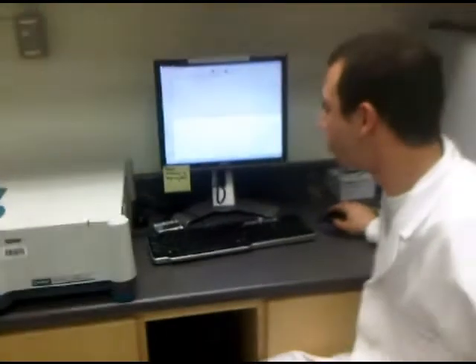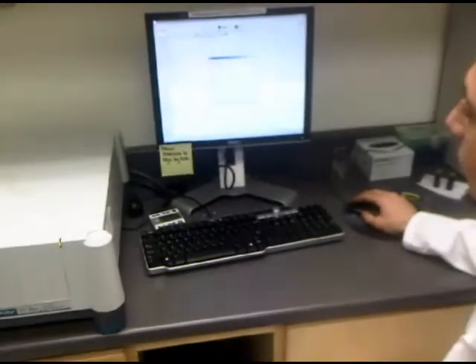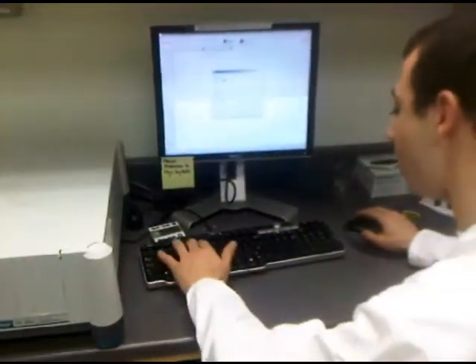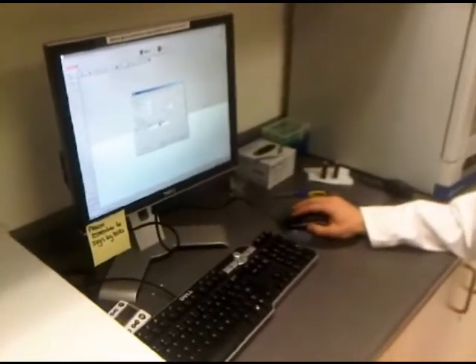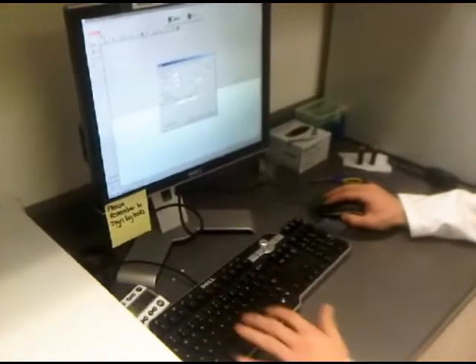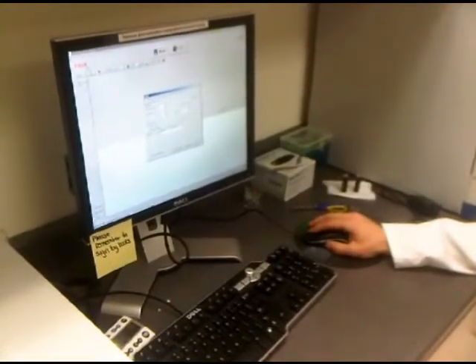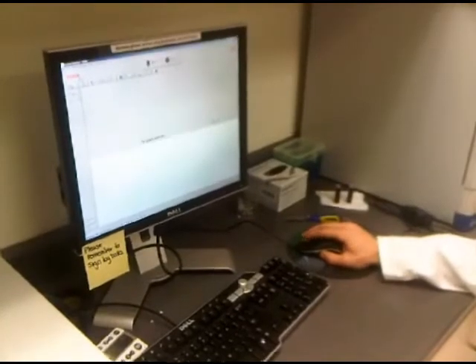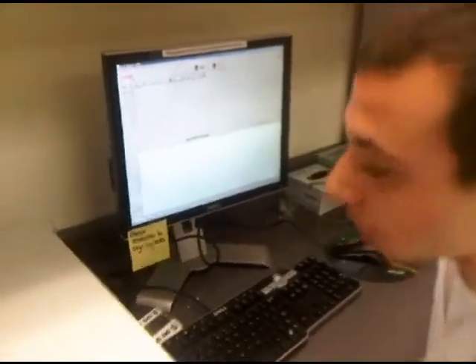Once you open up that program, you're going to click on Setup. So we scanned from 300 to 700, and let's say it absorbed most at 550 — so we're going to put that in. Then at the run time, we're going to make it stop at 10 minutes. Again, Y Max at 2 and Y Min at 0. So once everything is properly set up, we're going to hit OK.